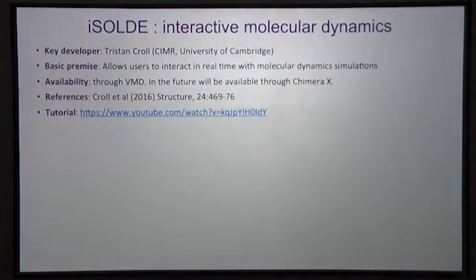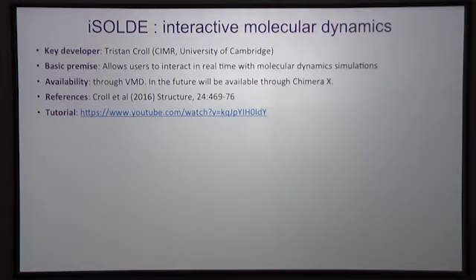So this is a relatively new program from Tristan Croll, who's now at the CIMR at Cambridge, called ISOLDE. And the idea behind this is that you as a user can directly interact with a molecular dynamics-based simulation. And really, it's particularly good on problematic regions, whether those are loops or things in not particularly good density.